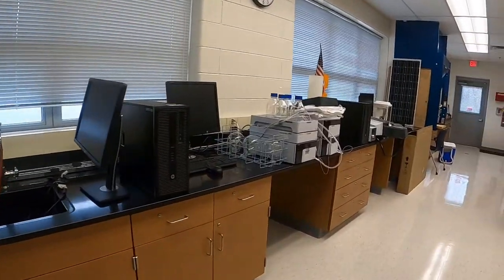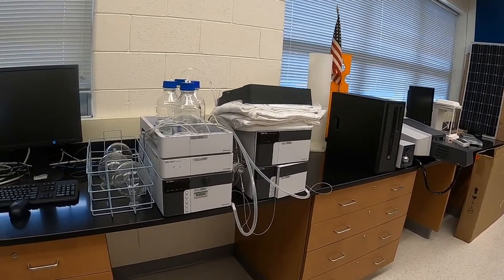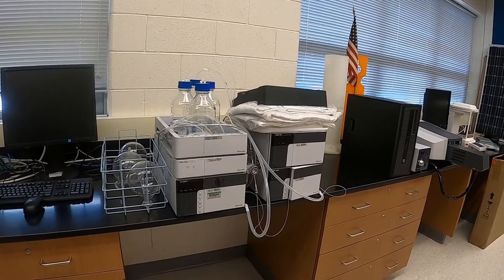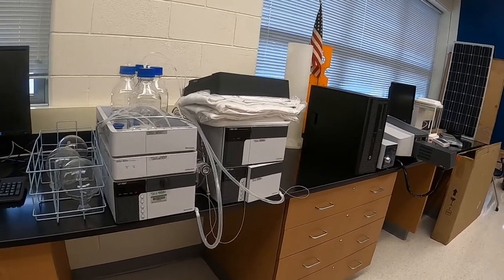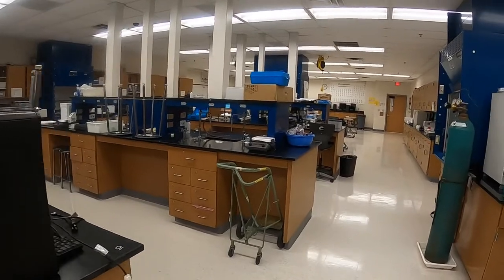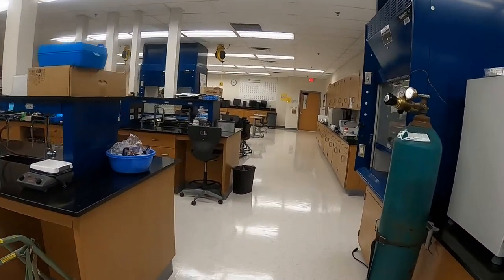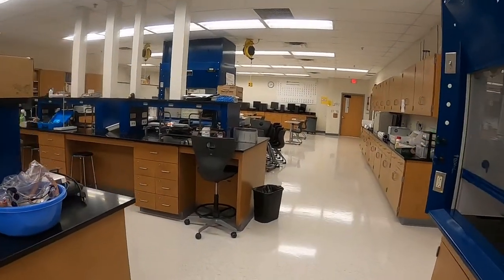And then throughout the lab, there's other types of equipment for different types of chemical analysis applications. Here we have what's called a liquid chromatograph for analyzing unknown mixtures of solutions, commonly organic solutions. And like I said before, there's a variety of equipment and project areas within the lab.